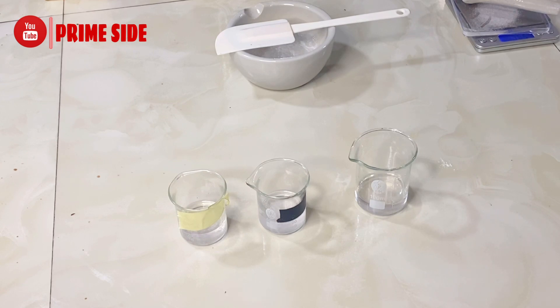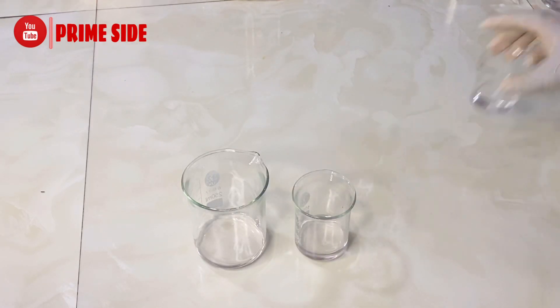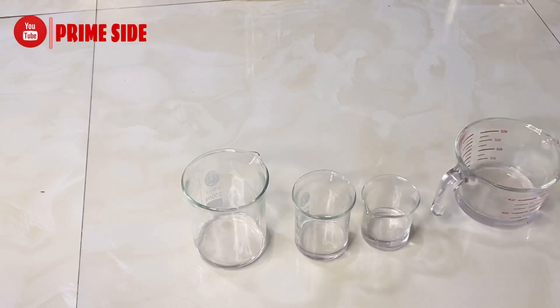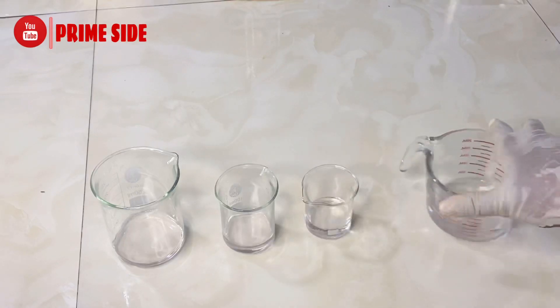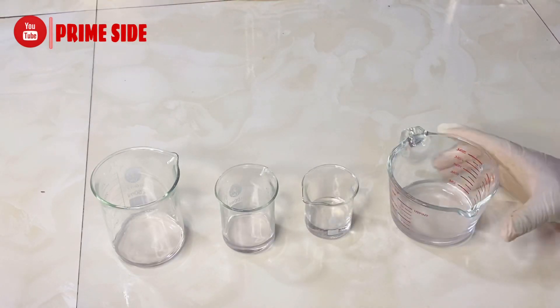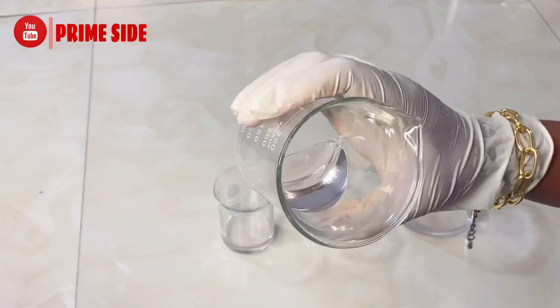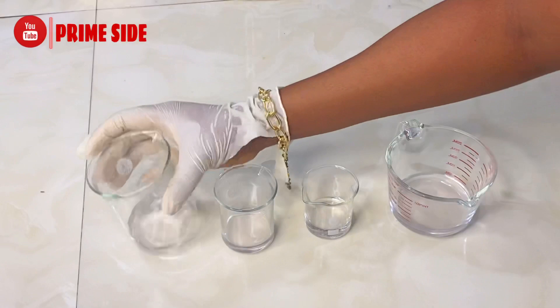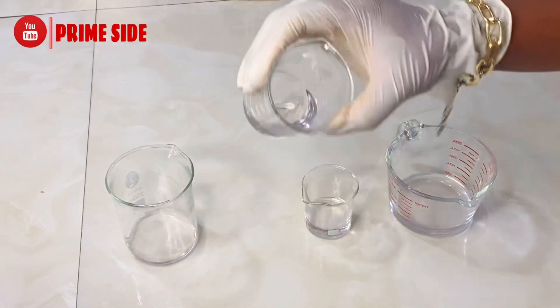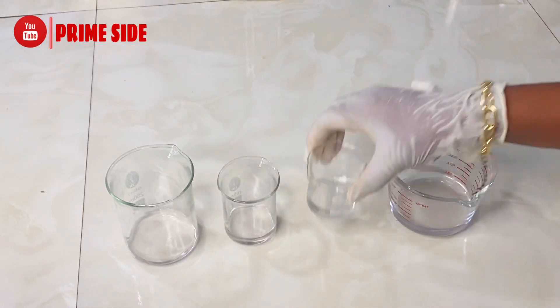I also have another beaker containing propanediol 1,3 with a powdered salicylic acid. So these are a range of solutions I carried out in another experiment: four beakers total, two containing fine and crystal salicylic acid in propanediol 1,3 respectively, and the other two containing fine and crystal salicylic acid in propylene glycol.